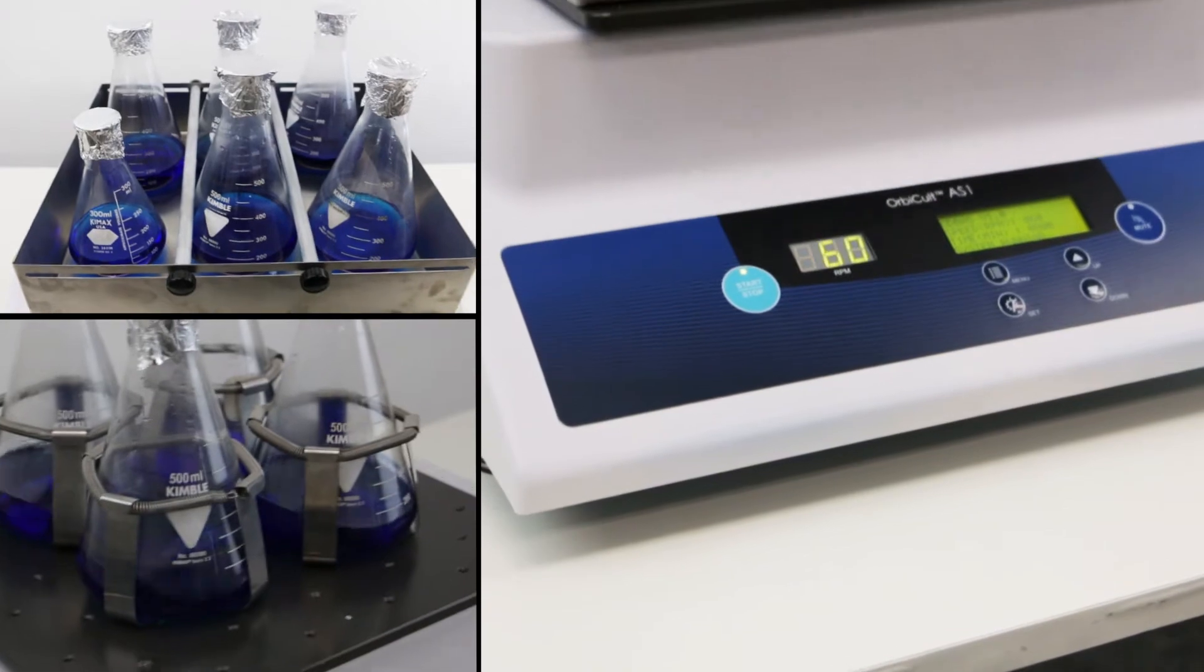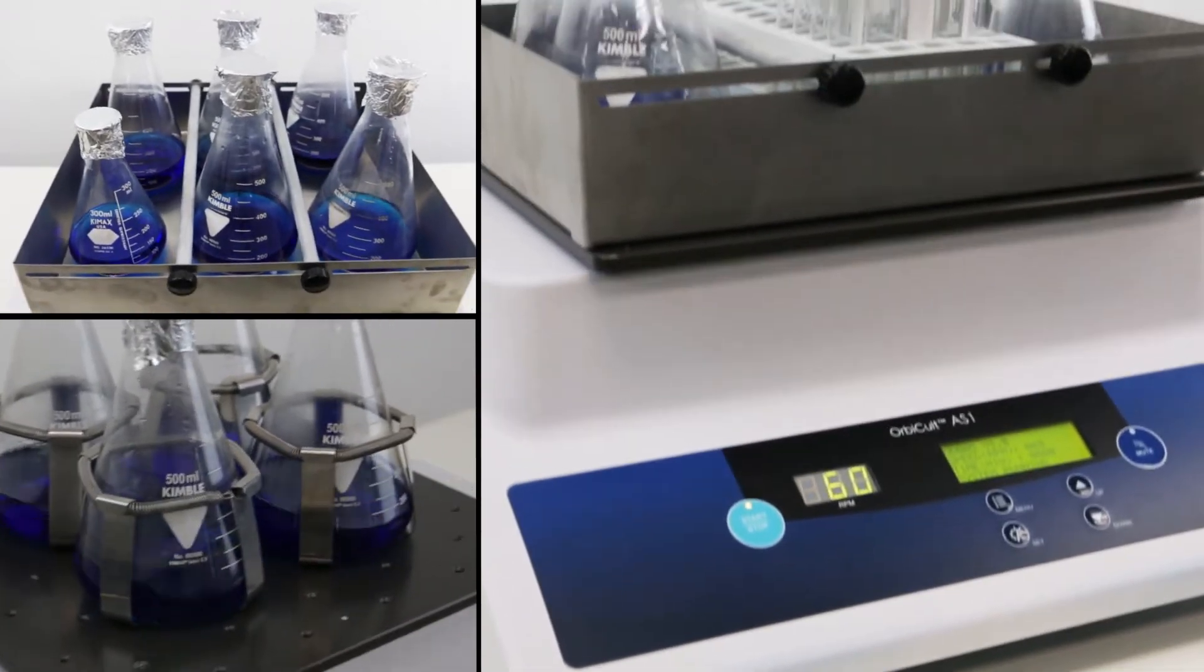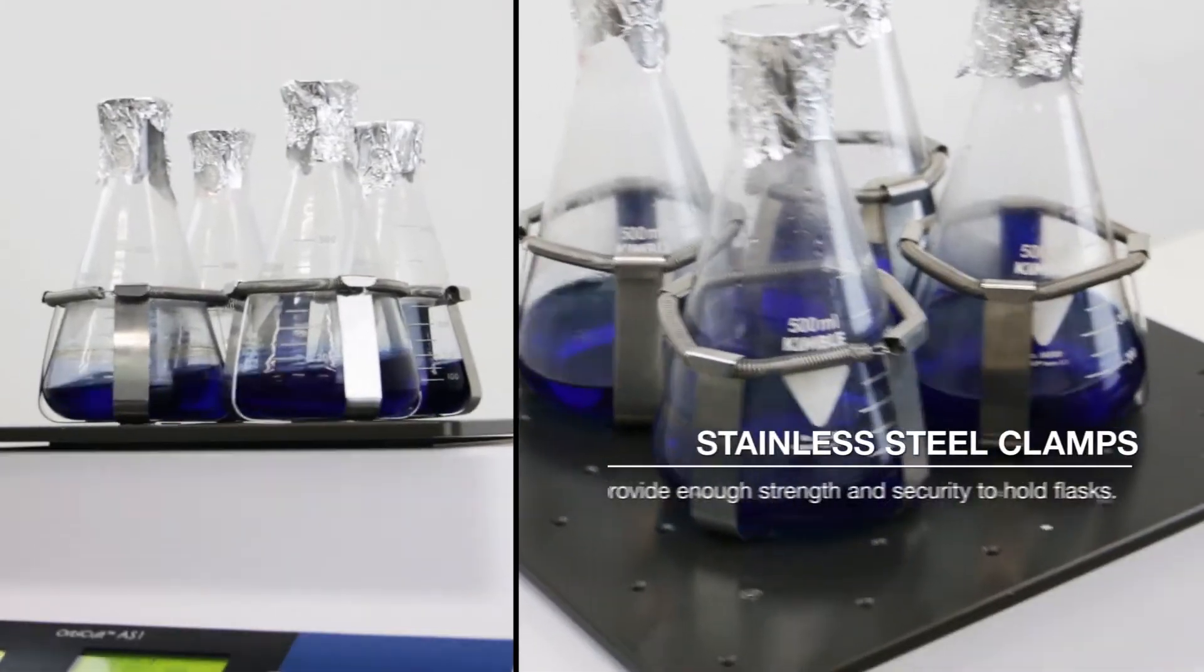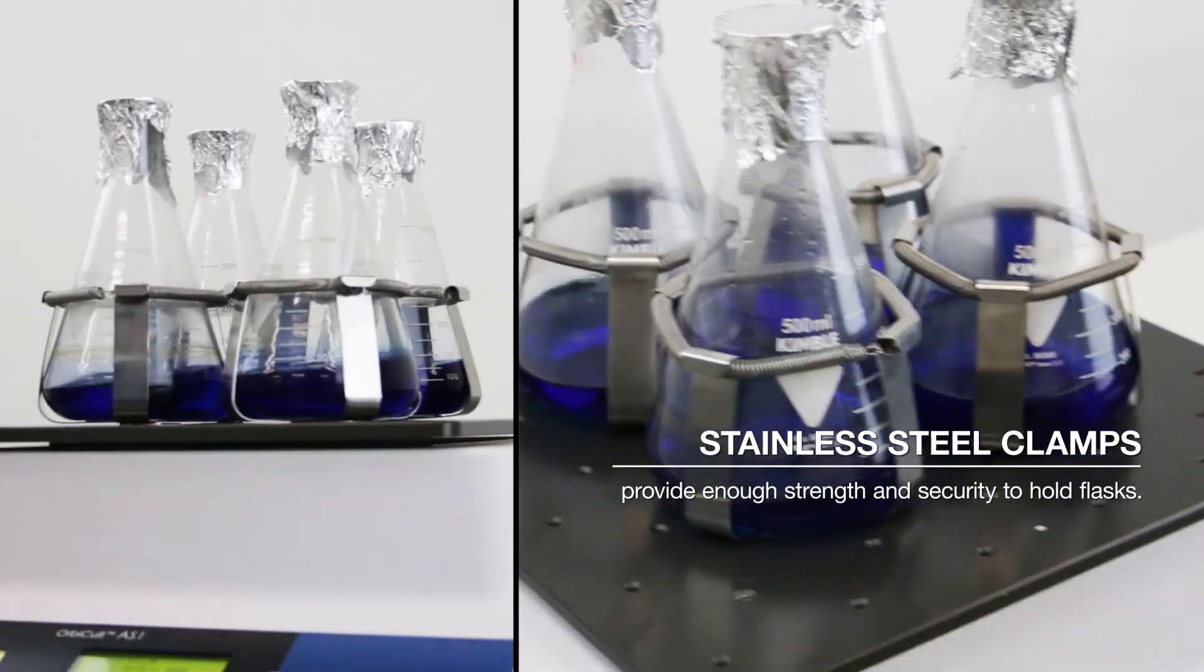Offers multiple choices of accessories which allow to customize and meet the appropriate application. Stainless steel clamps that provide enough strength and security to hold flasks.